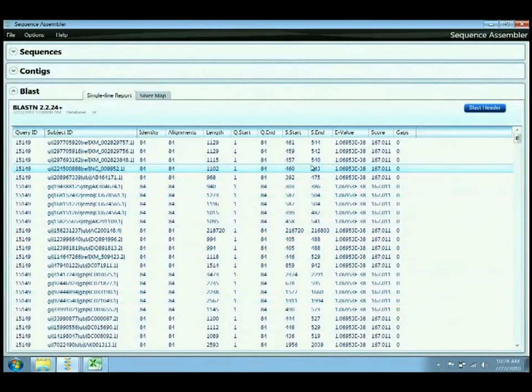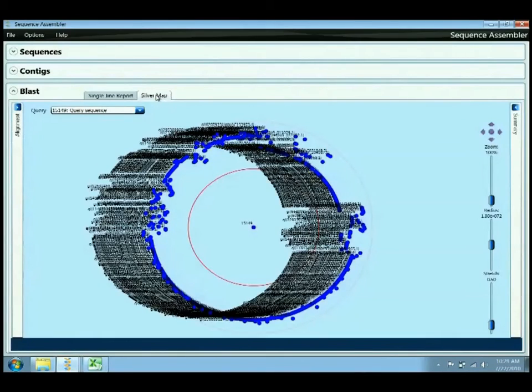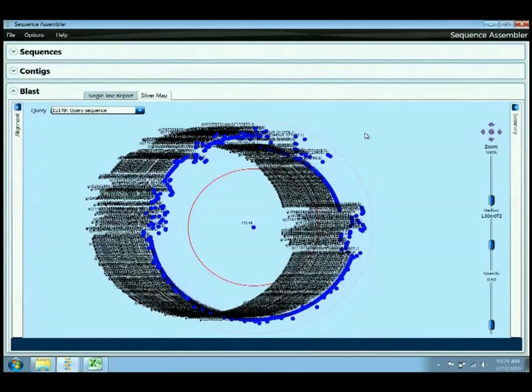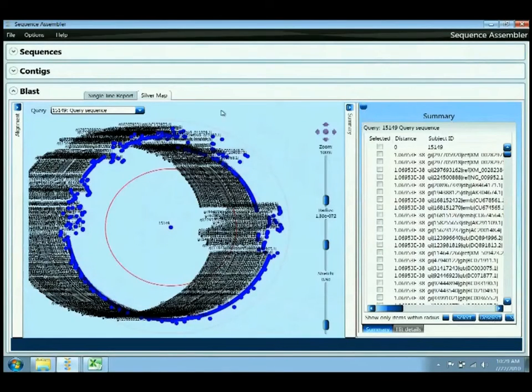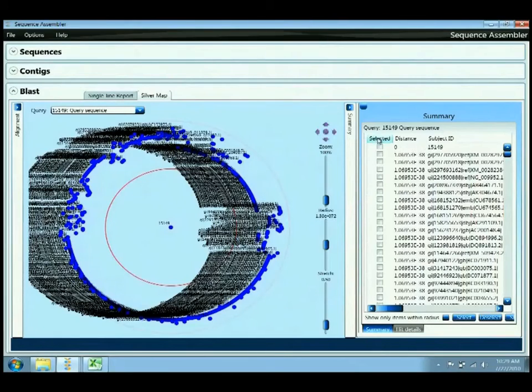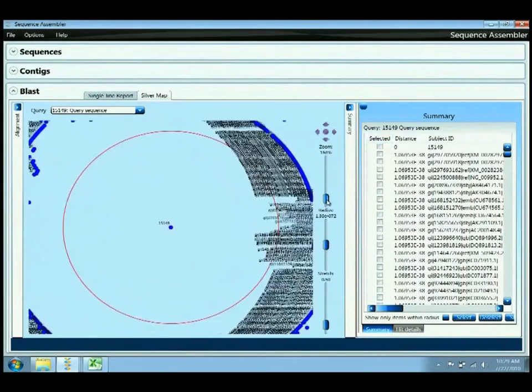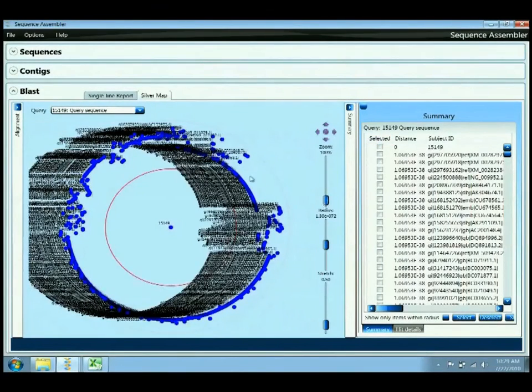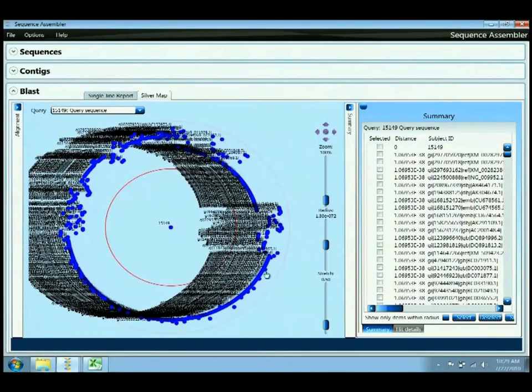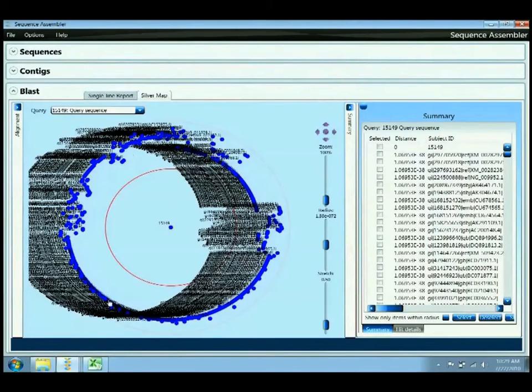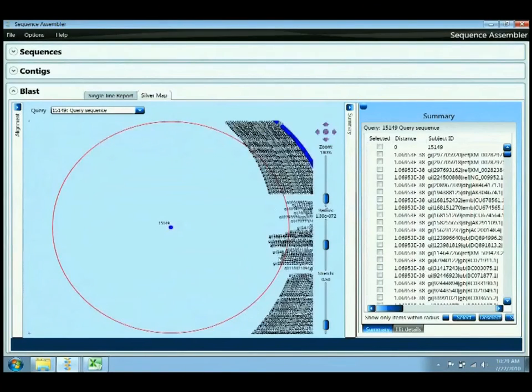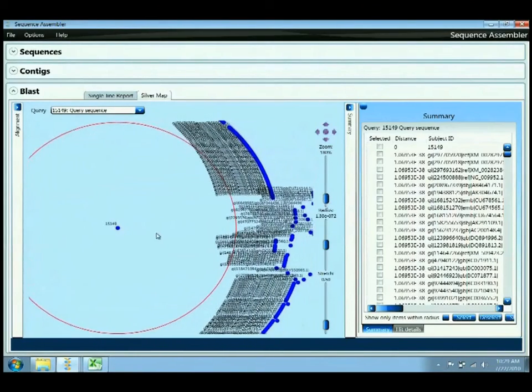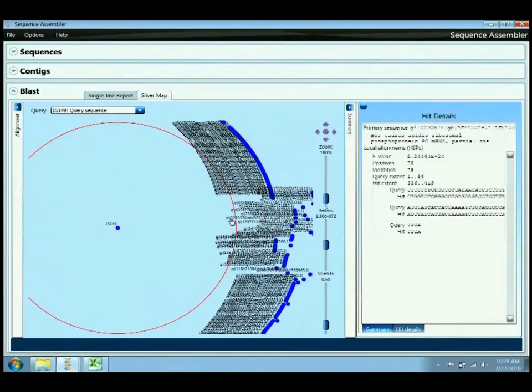Perhaps an easier way to visualize this would be to use this SilverMap component, which has been contributed by the Queensland University of Technology in Brisbane, Australia. This control provides the hit table information in a heat map type of visualization so that you can see the closeness and similarity of the returned hit values to the query sequence in the middle. By zooming in and selecting the different data, you can select on something, and it will give you the details of that object in the right-hand pane.